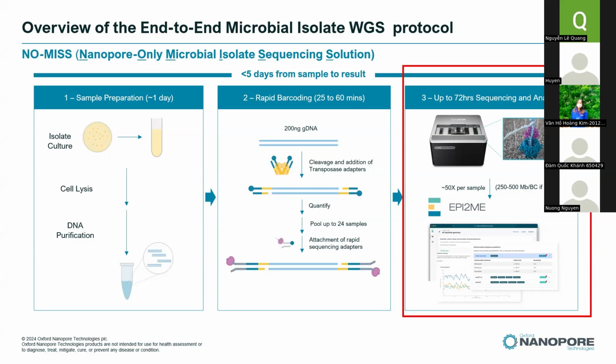So I don't understand the question. Can you please elaborate your question, please? I see in the slides, the purple color means the rapid sequencing adapters. Is that the motor enzyme?